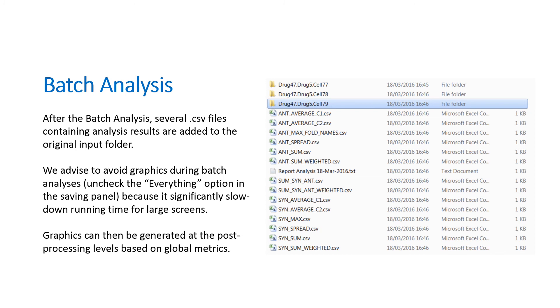After the batch analysis, several .csv files containing analysis results are added to the original input folder. Analysis results are summarized in tables containing all experiments in rows and metrics in columns. If the Everything option was selected among the Save During Analysis options, graphical outputs are organized within each experiment folder, as for the normal analysis illustrated before. However, we advise to avoid graphics during batch analyses, because it significantly slows down running time for large screens. In the context of HTS, we recommend to run the analysis by saving only metrics. Graphics can then be generated at the post-processing level based on global metrics. ComBenefit can be run in single mode for each one of the identified combinations, by selecting the desired options and graphical displays.